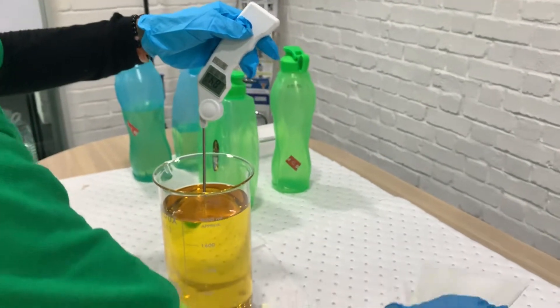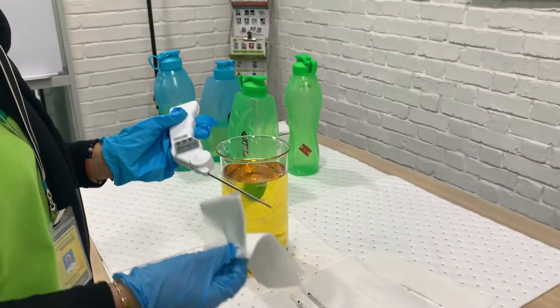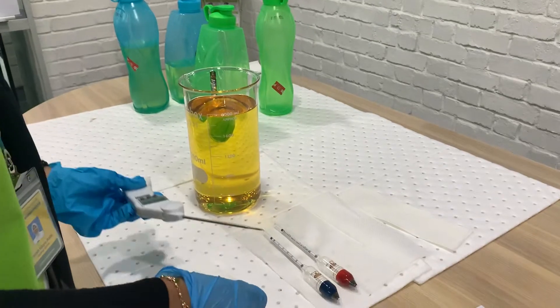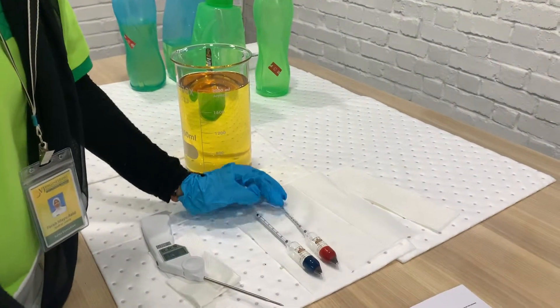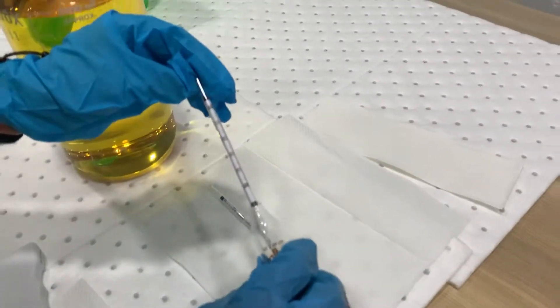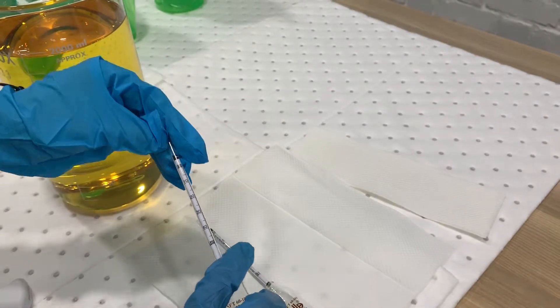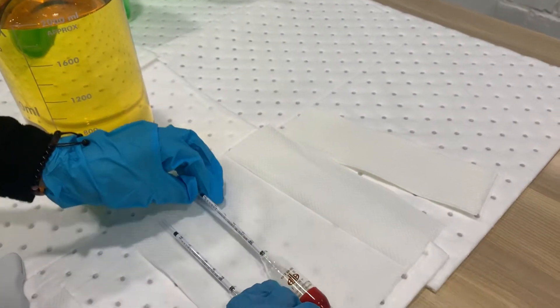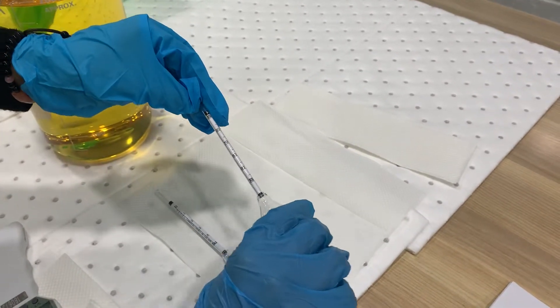Then we remove the thermometer. The hydrometer comes with two readings: the first is 0.800 to 0.850, and the second is 0.850 to 0.900.